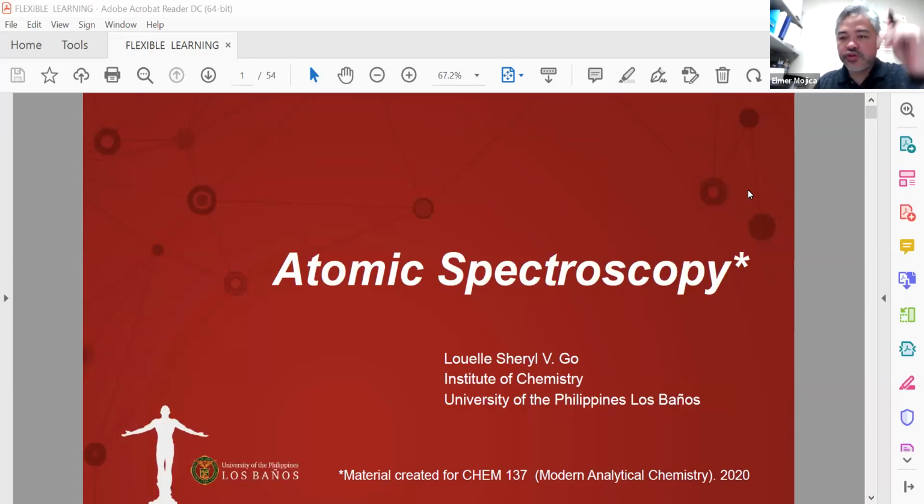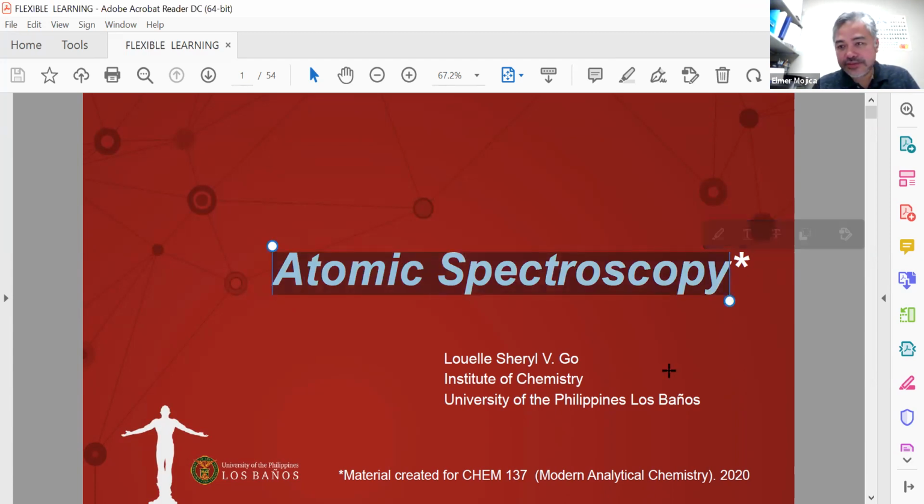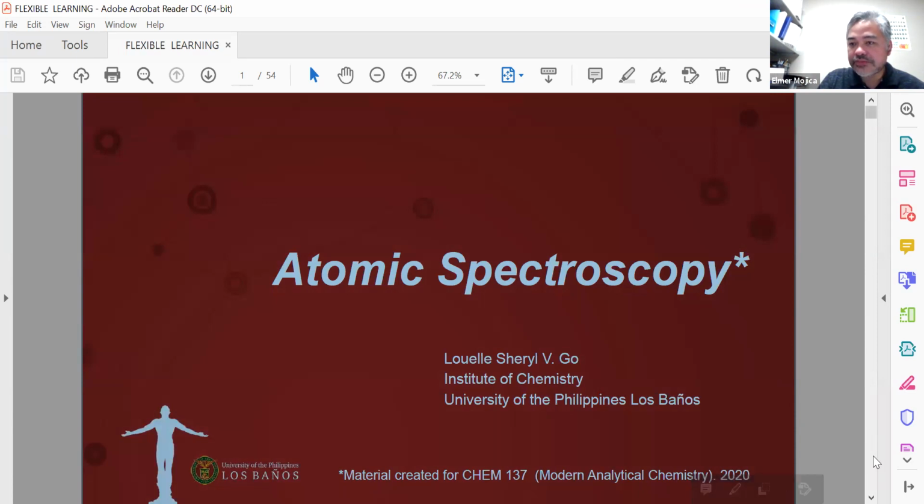Okay, for the next module, we're going to talk about atomic spectroscopy. So this still deals with the interaction of matter with light, but we're going to look at this interaction at the atomic level. So far, the UV-Vis that we have discussed is molecular spectroscopy. Now we're going to talk about spectroscopy at the atomic level.